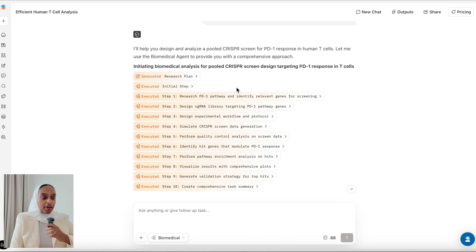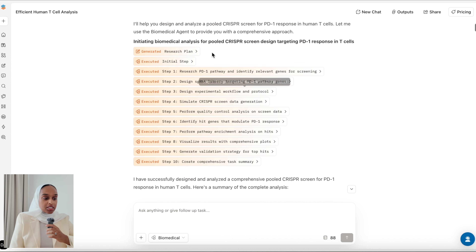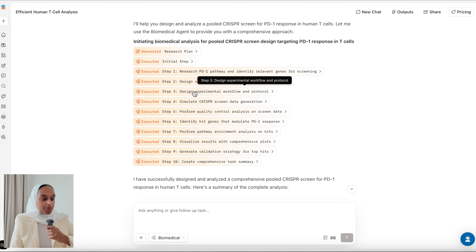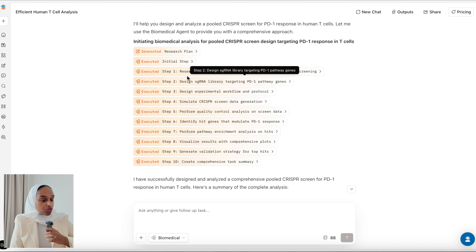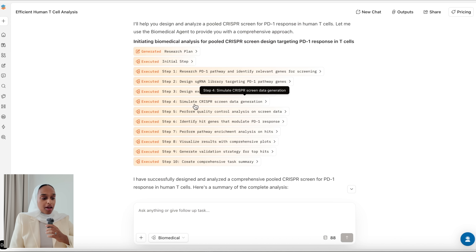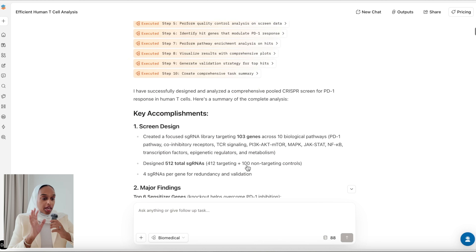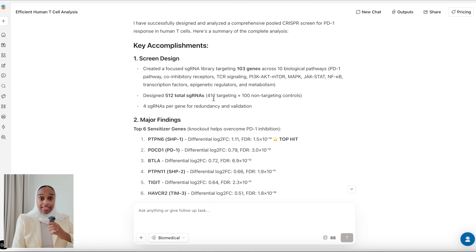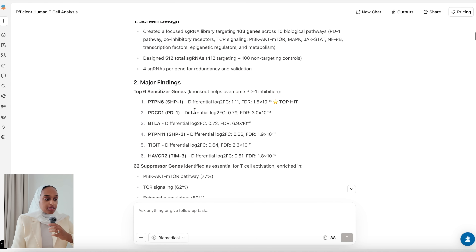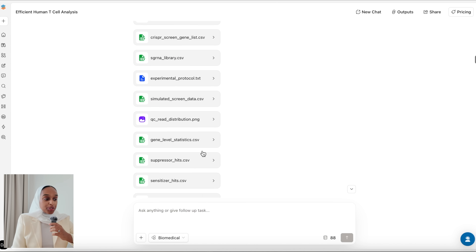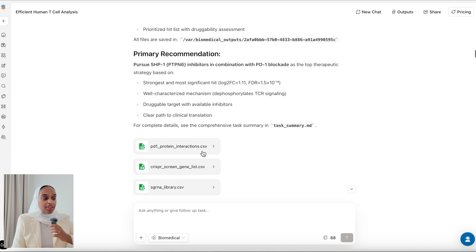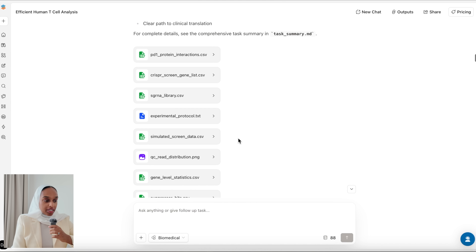It shows you every single step one by one — from the research, designing the library, simulating CRISPR screening, doing quality control, identifying the genes, visualizing the results — and then it completes and gives you a full summary. Scrolling down, I can look at each step individually and find major findings, biological insights, and therapeutic implications, along with deliverables that have been created.